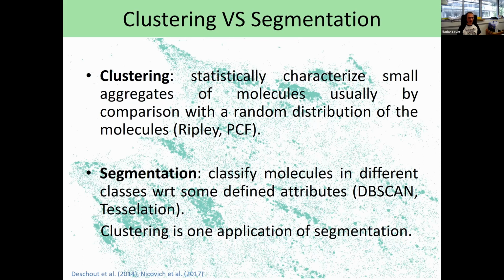So in a way, we can see clustering as one application of segmentation, because you cannot use clustering to do segmentation, but you can use segmentation in a way to do clustering, but clustering is still statistically relevant, which is not necessarily the case with segmentation.